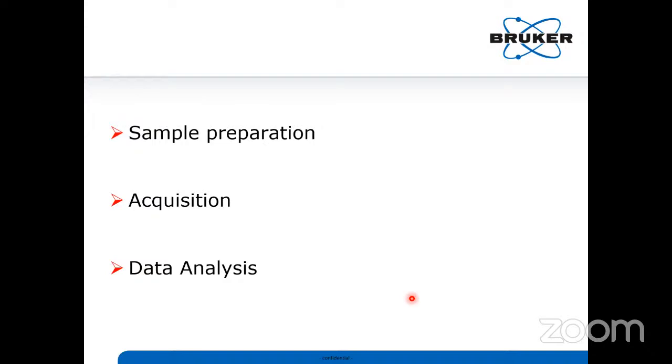The same thing applies for fragmentation also. Simply, you can't do all peaks for MSMS fragmentation. You are just going to sit on some scrap data. You should know exactly what the concentration of your sample is. Based upon concentration, you should give the noise level and the mass range you want to filter. This is the mass range and threshold you want to set for fragmentation level. Simply, if you acquire complete data, MS level and MSMS fragmentation, it may generate 4 GB, 5 GB of data, where you will waste more than 1 week, 2 weeks simply to analyze the data.